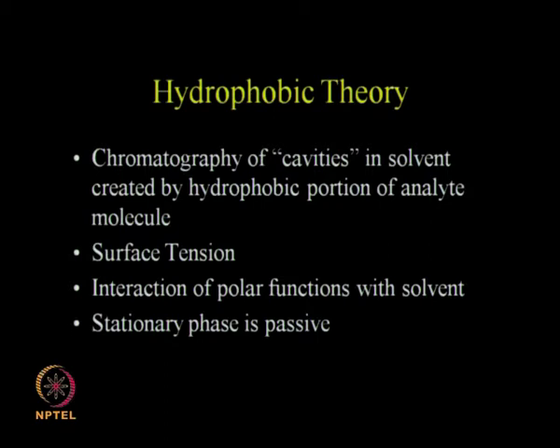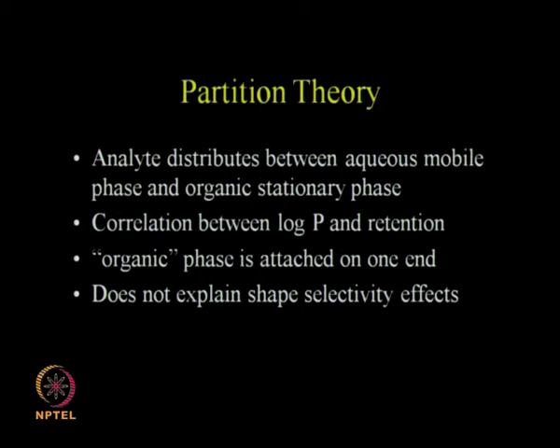So we have the solvent and the analyte interacting because of the cavities of hydrophobic regions. That is what the hydrophobic theory says. Now partition theory: this is the partition which we have been talking about in liquid chromatography or in extractions and so on. So the analyte distributes itself between the aqueous mobile phase and the organic stationary phase. Okay, so there is a partition.